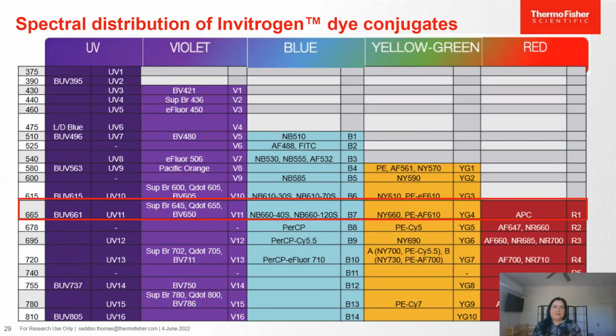So if you had something that might be highly expressed and cause an issue in terms of your panel, you might put something on, say, BUV 395 or 805 or somewhere else so that you weren't dealing with those cross-excitation issues. In addition, as you're building a panel, think about what cells you're putting next to what antigens. So you could put something like CD4 and CD8, but you might avoid something that would be co-expressed on both those cells because it makes it harder to resolve.